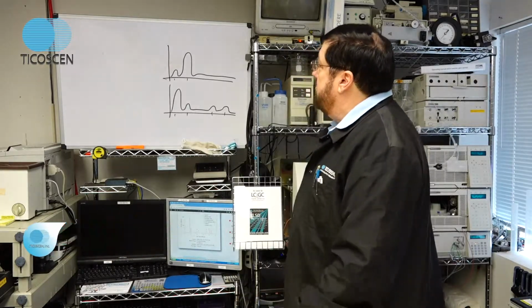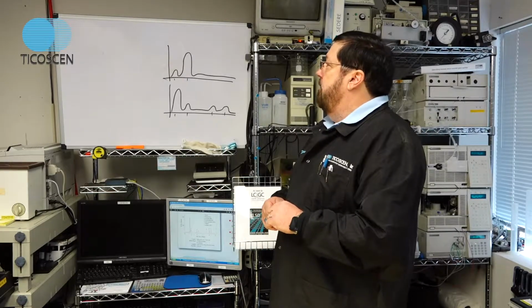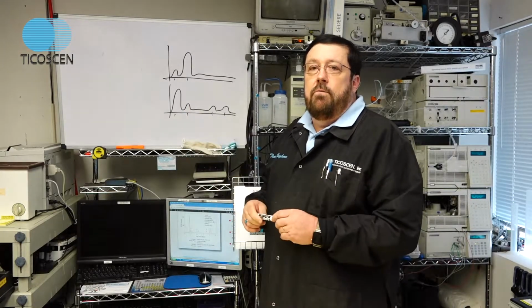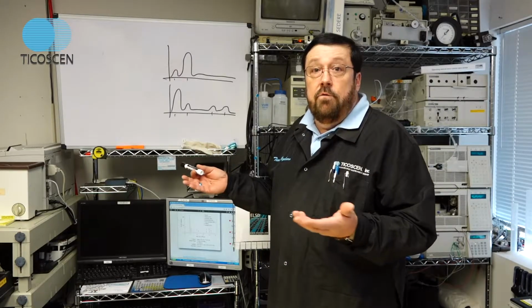Why use ELSD? To characterize non-chromophoric compounds and to confirm purity. For one example that we ran into about 30 years ago at Varex, we had a large petroleum company submit a sample to us for purity. And they had a 2-component separation they thought was pure. And they asked us to run it on an ELSD. They had done the test on UV.